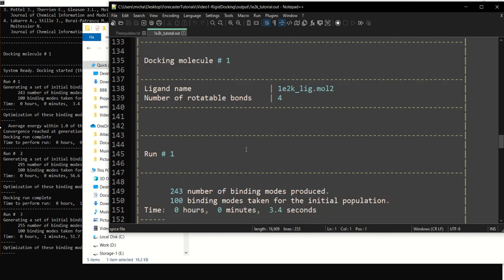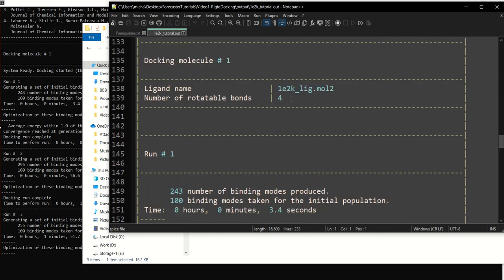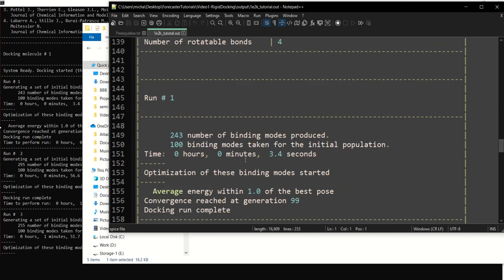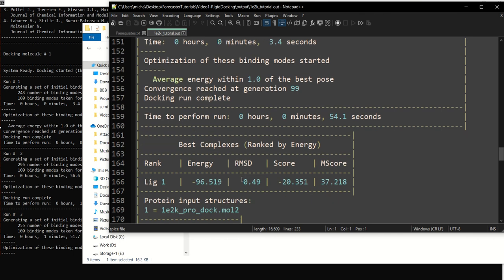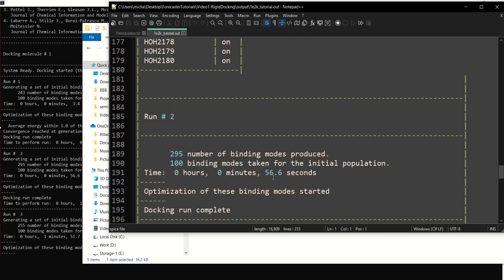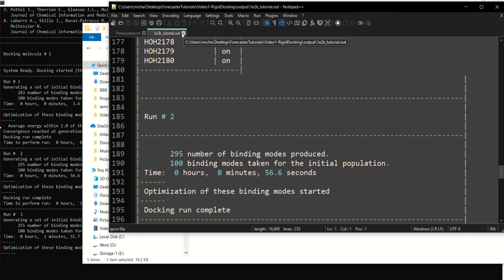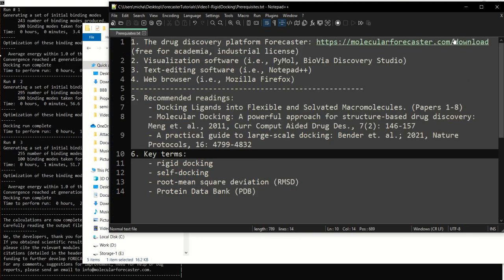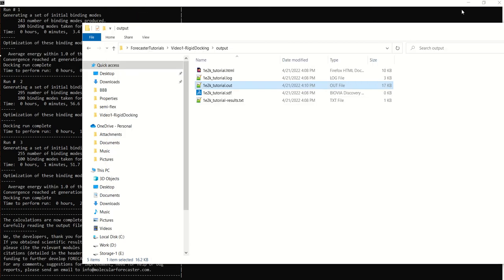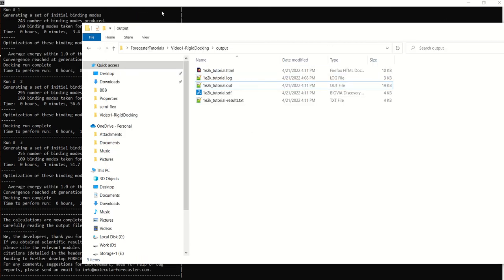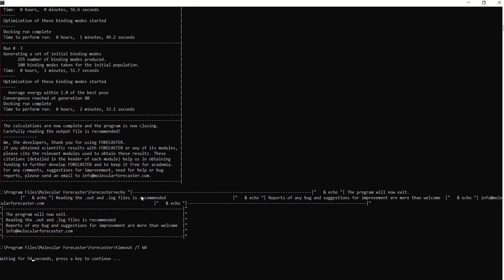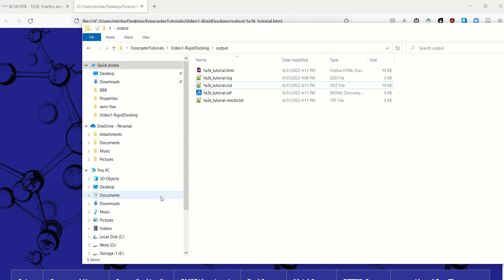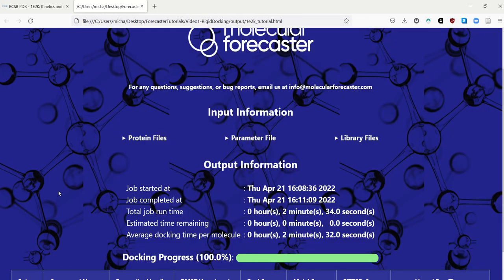The number of rotatable bonds of the ligand. How many binding modes have been produced. And what the energy. The RMSD. And then the rank score. And then the match score of this particular run is. And this is for every single run that we do. So once this is done. You will see the ending text. And then you can press any key for this to end.